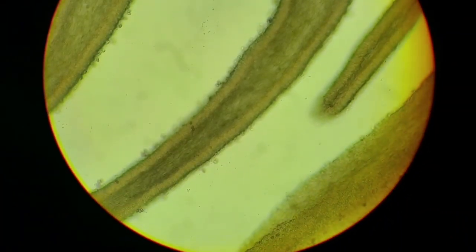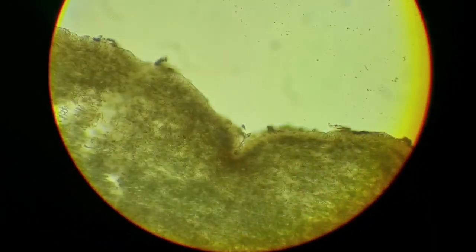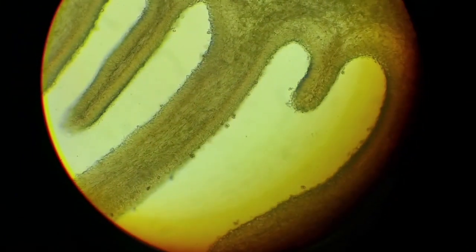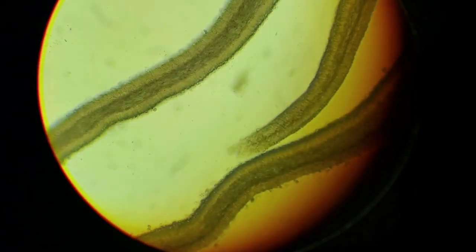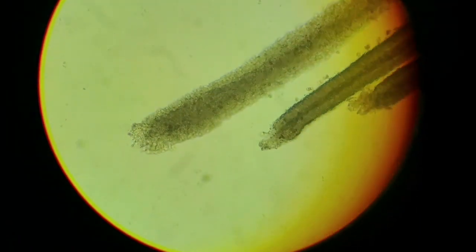So this one's much better. Try to get it in focus. So if we go to the top of the cap, so we're going to say this is the top. I may have removed the topmost. I mean, no, this looks okay. So this is the top of your cap. This is your pileipellis context. And then you look at the gills, and the gills are still in the appropriate orientation. I believe not any of them have really twisted. However, whether or not we actually captured the very end, the edge of the gill, is still to be determined.